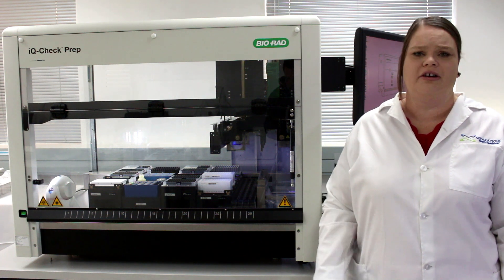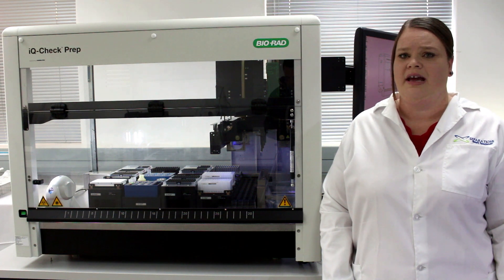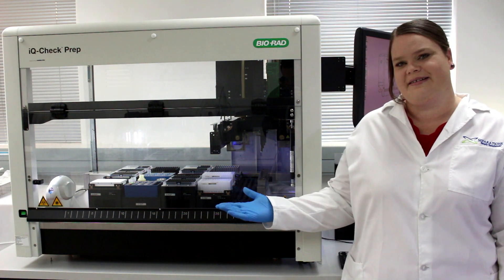It can process a large number of samples, nearly 500 samples in an 8-hour shift. Today we're going to chat more about this system.